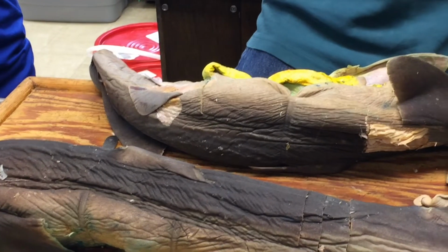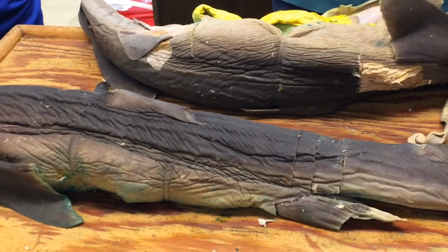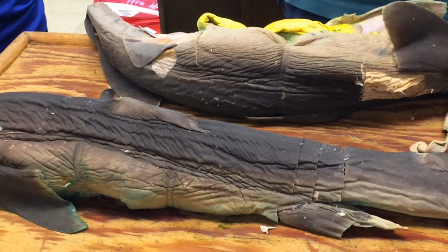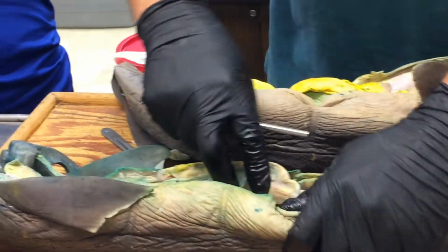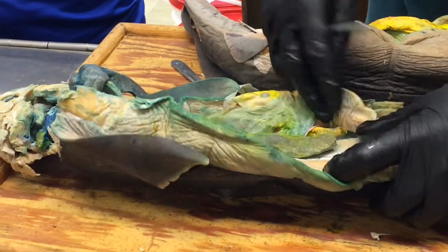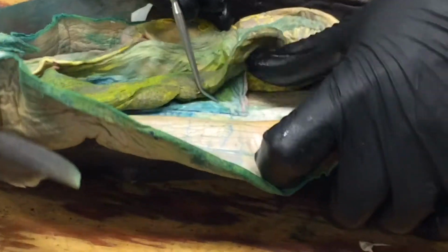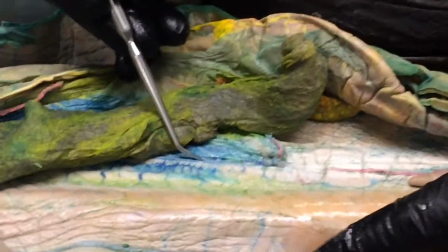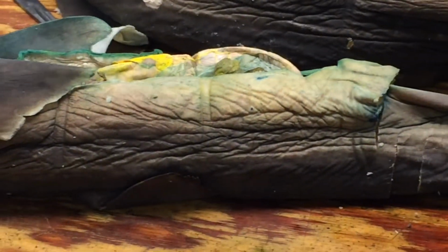And you can't really see the afferent efferent renal veins, but the blood's going into the kidneys, it's leaving the kidneys, and eventually where it leaves to is the posterior cardinals, which run right down the midline between the kidneys here. And you can see kind of injected running along like that there, the blue, and that's the posterior cardinals. That's going to then drain that blood back to the heart. Okay.